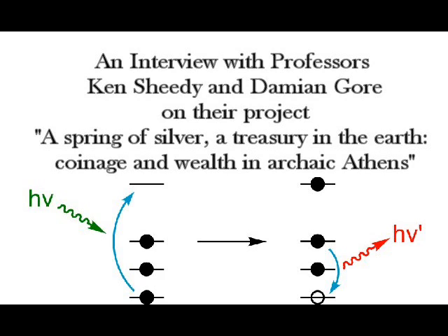What you need to do is measure certified reference materials, which you can buy with the right matrix, whether it's a gold matrix or a silver matrix representing gold or silver coins, and you have to get the right trace metals in those matrices. And then you have to make sure that you get the values that are certified, and that's accuracy, how close you can get to the true value. So an analyst has to pay a lot of attention to accuracy. And in this program, we will have spent about $15,000 on certified reference materials. Maybe that's a bit over the top, but we want it to be absolutely defensible that we've constrained our accuracy properly and very well for reporting.